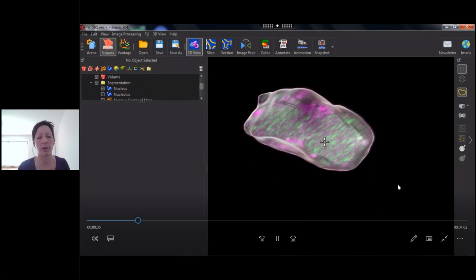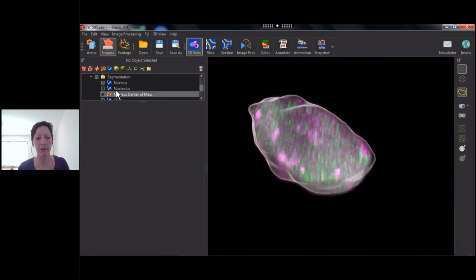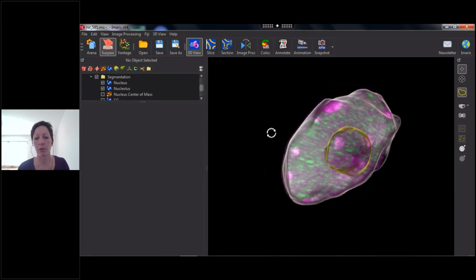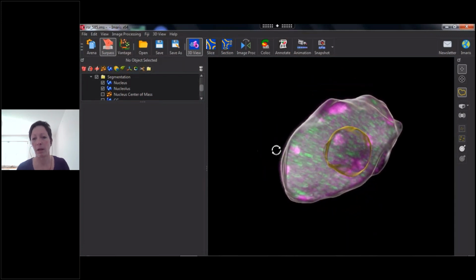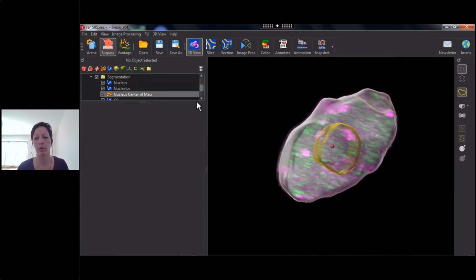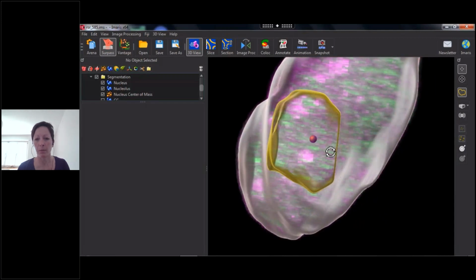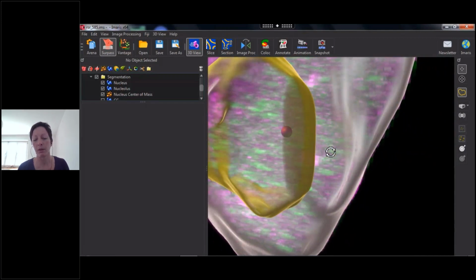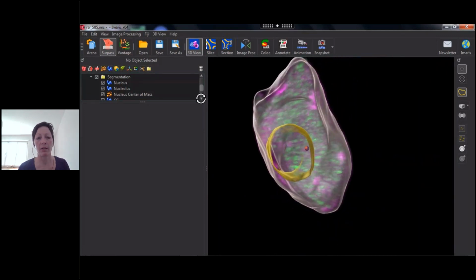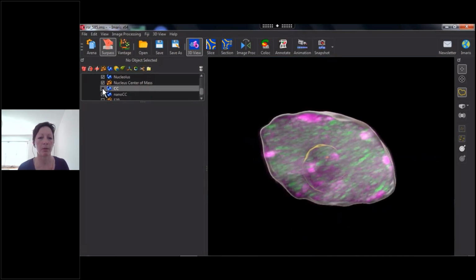You see a folder called segmentation, where I created what we call objects, which represent a nuclear contour, an object which represents the nucleolus, and it allows them to define perhaps a distribution of the signal in relation to the nucleolus. It can be inside or outside. This little orange dot that you see now appearing is an object that we plot inside the nucleus. It's called the center of mass. We actually need it to normalize the distances that we will derive from the signal spots later on.